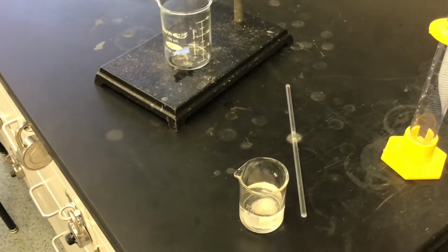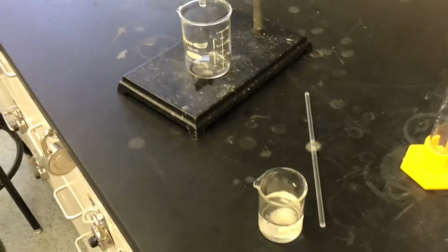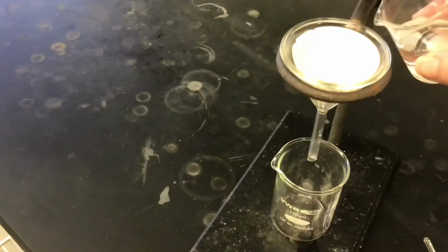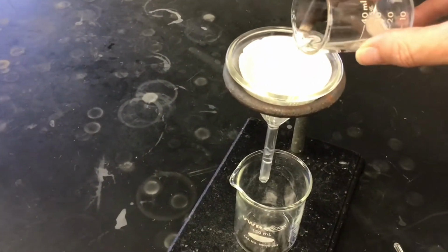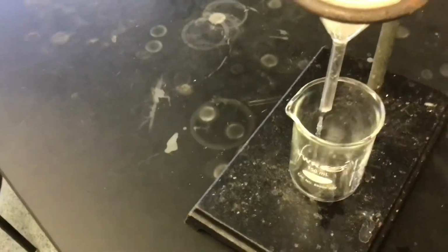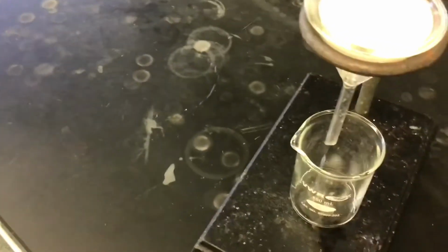Okay, so the stuff you see at the bottom should be sand. So what we want to do now is separate the salt water from the sand, which is why we're going to filter. So we're going to pour this through the filtering paper. Okay, and we're going to let it drip through so you can see how it's dripping through. And then it tells you in your lab to rinse it some more with water.